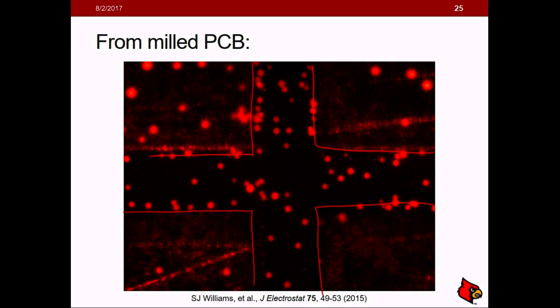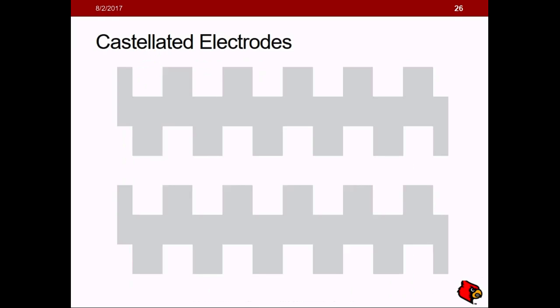You will see negative dielectrophoresis, and particles will be trapped at the center of the device once the field is applied. So that is negative dielectrophoresis. And if you go back and replay the video, you'll see some pearl chaining in the video as well.